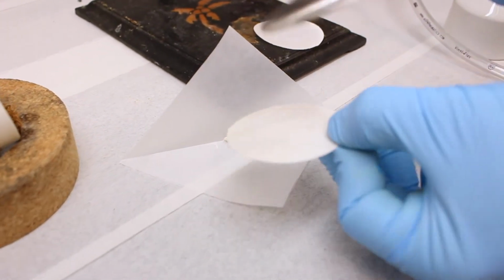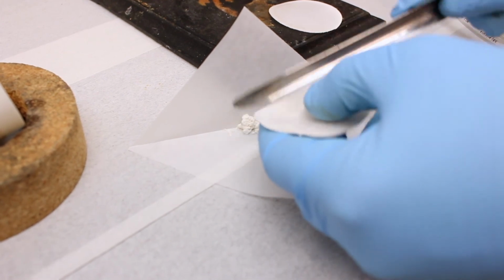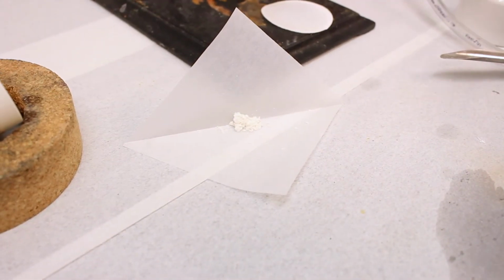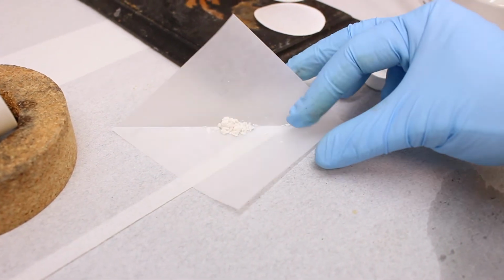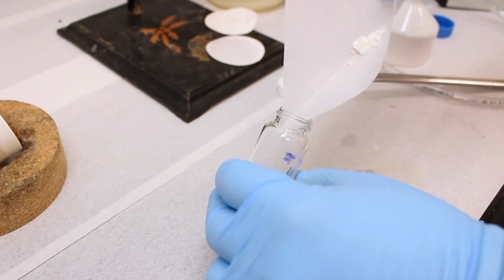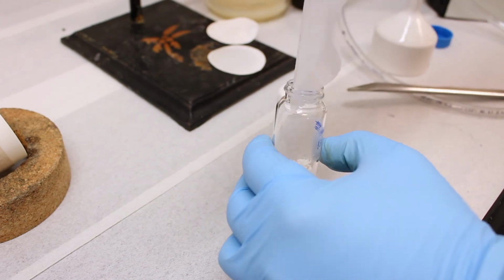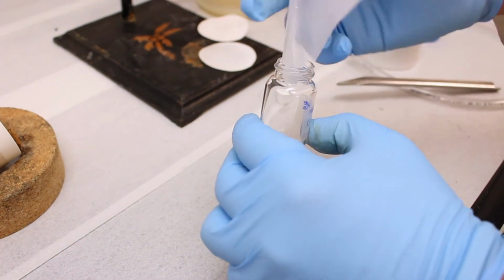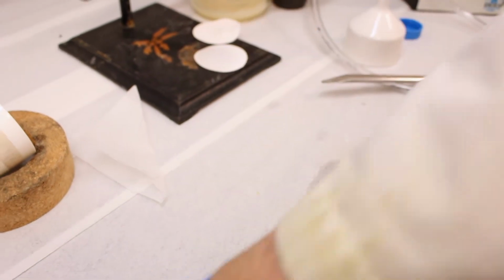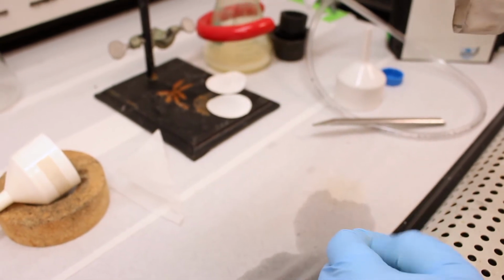And there's still a little bit on the filter paper, so I'll try to scrape some of that off. Okay. So now we'll take our powder here and we'll place it into our sample vial, which is pre-weighed. Okay. So we'll place this vial into the vacuum desiccator and let it dry to remove any residual water, and then we'll get a final mass.